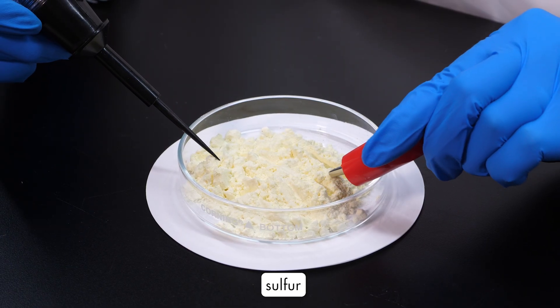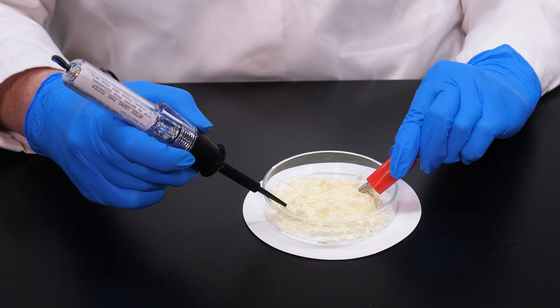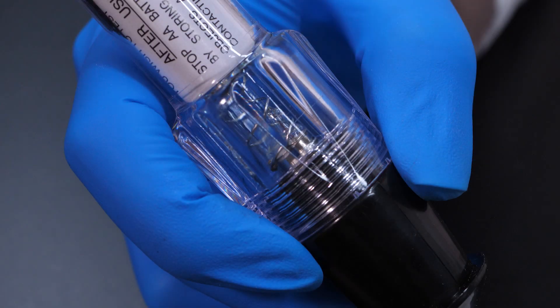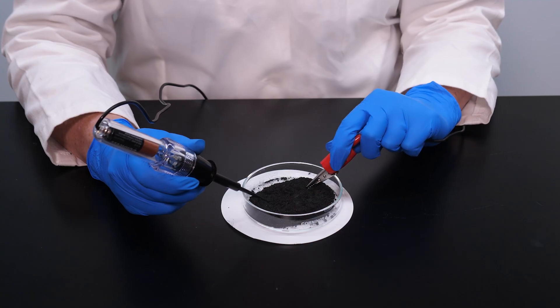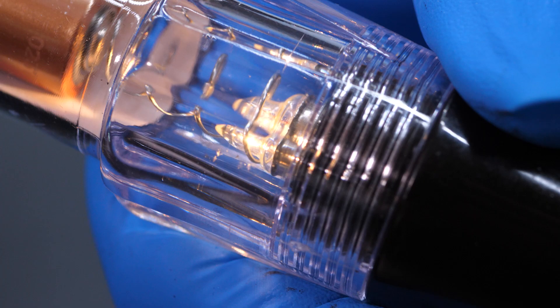Most nonmetals are poor conductors of electricity. If a substance conducts electricity, the light on this continuity tester will come on. As you can see, sulfur does not conduct electricity. However, carbon is an exception. Graphite, a form of carbon, is a good conductor of electricity.